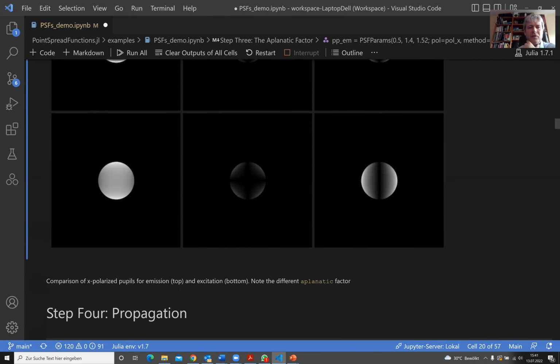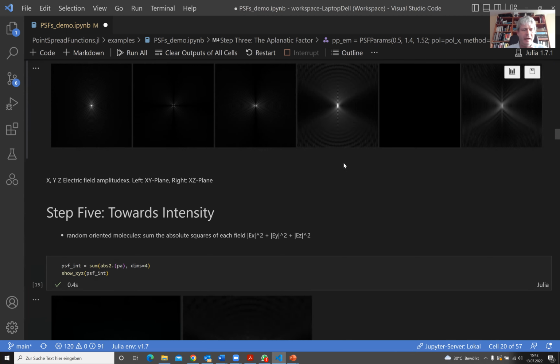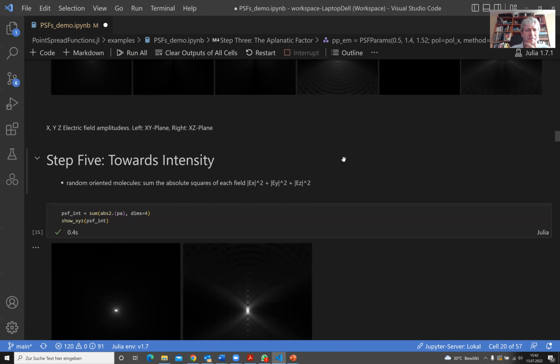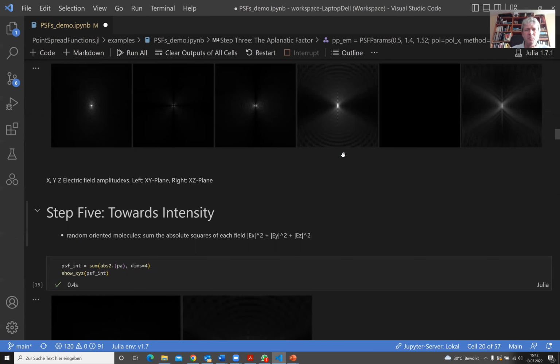It's using the angular spectrum of plane waves method, and that has a particular problem, as you might see here. Once you get far enough out of focus, you get into aliasing problems, and this essentially means that the far out-of-focus regions suffer from quite severe artifacts. As you see here, these fringes are not supposed to be there. And to avoid that, there are other methods, as I will describe below.